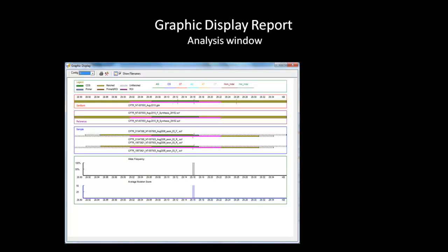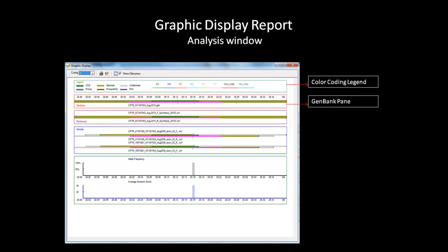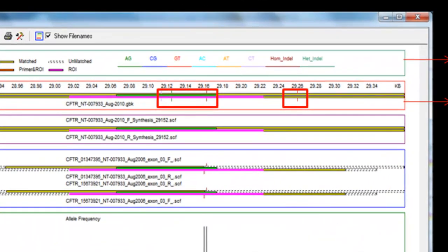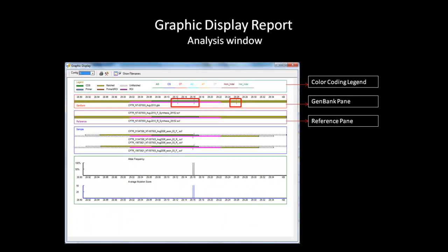Clicking OK after selecting the appropriate settings will bring up the analysis window for the graphic display report. The first pane contains a color coding legend that explains which color indicates the ROI, CDS, and different types of variation. The second pane is a GenBank pane which displays information about the loaded GenBank file. The color tick marks indicate reported variation and each color corresponds to the variation indicated in the color coding legend. The third pane is a reference pane displaying information about the reference trace used for the selected contact. The sample pane contains all the samples within the selected contact. The tick marks shown in the sample pane indicate variant positions that were detected in those samples.